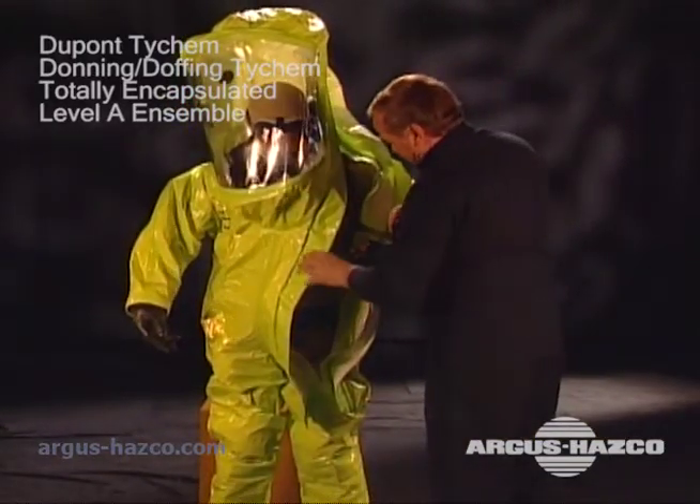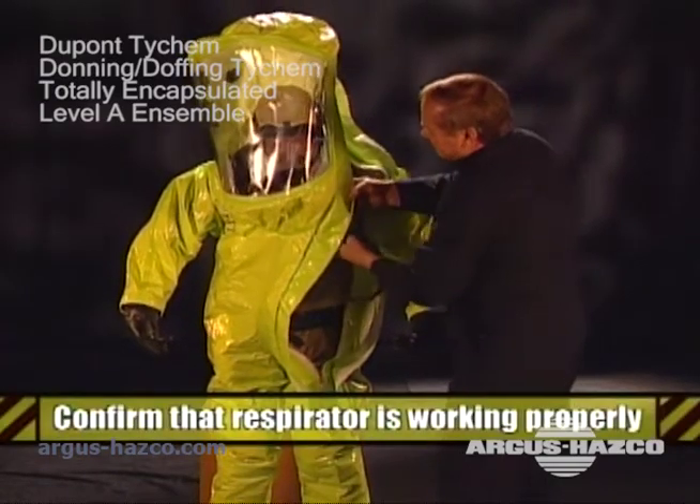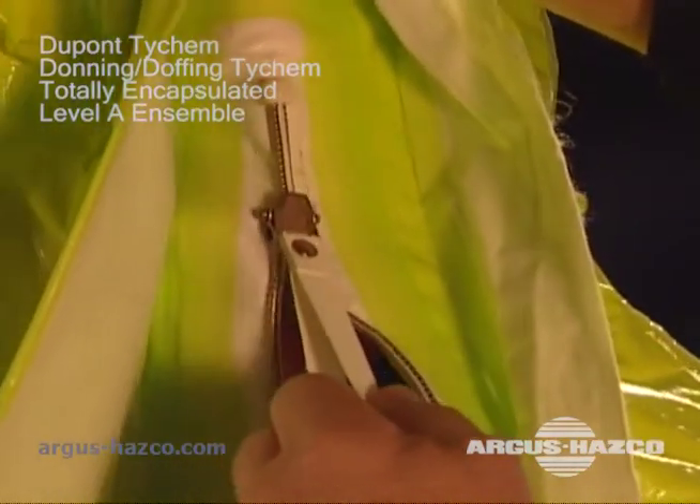If you haven't done so already, hook up your air supply to your mask and confirm with the assistant that the respirator is working properly. Then have your assistant pull the hood over your tank and head and zip the closure.